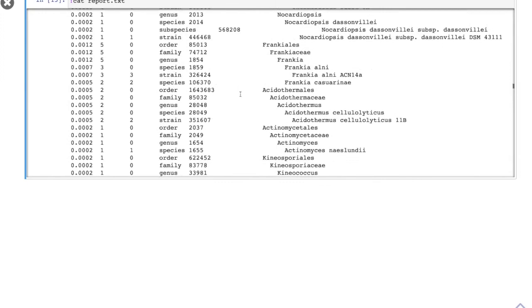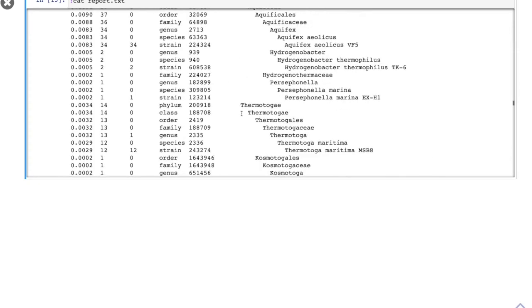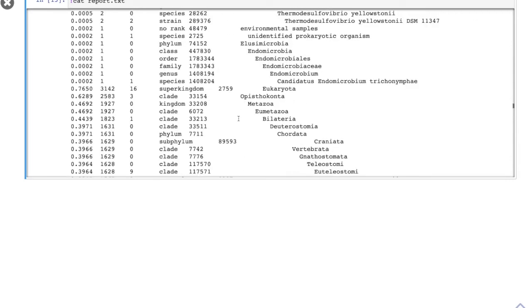So what we normally would do now in these cases is to use a software called Pavian to load this report. We will do it in a second. But one thing to keep in mind, normally if you do these experiments, you have samples from the infectious site, but you also have a sample from a control. So you sequence something like water in your lab, and then you subtract everything that is in the control from this report, because if it's in the control, then it's probably just lab contamination. By doing so, you're getting rid of a lot of these signals. However, for this study, the authors did not provide us a negative control, so we have to work with what we have at the moment.